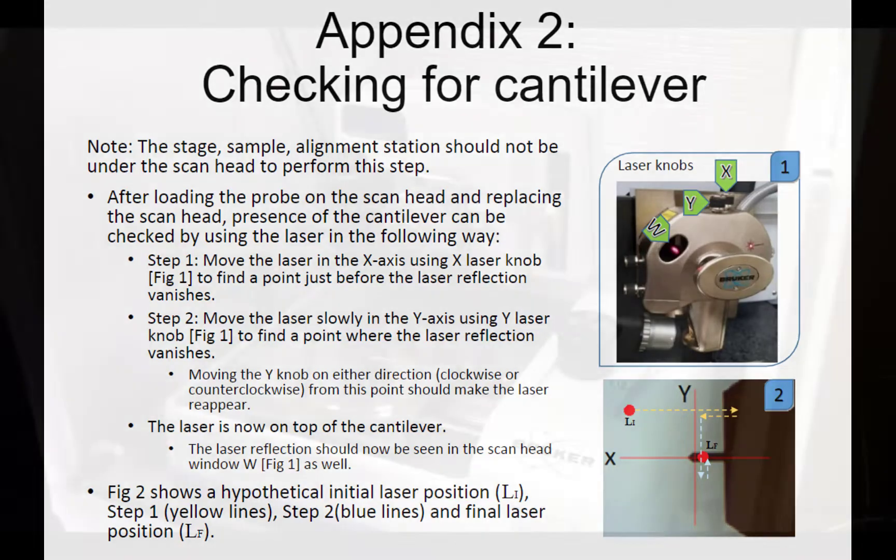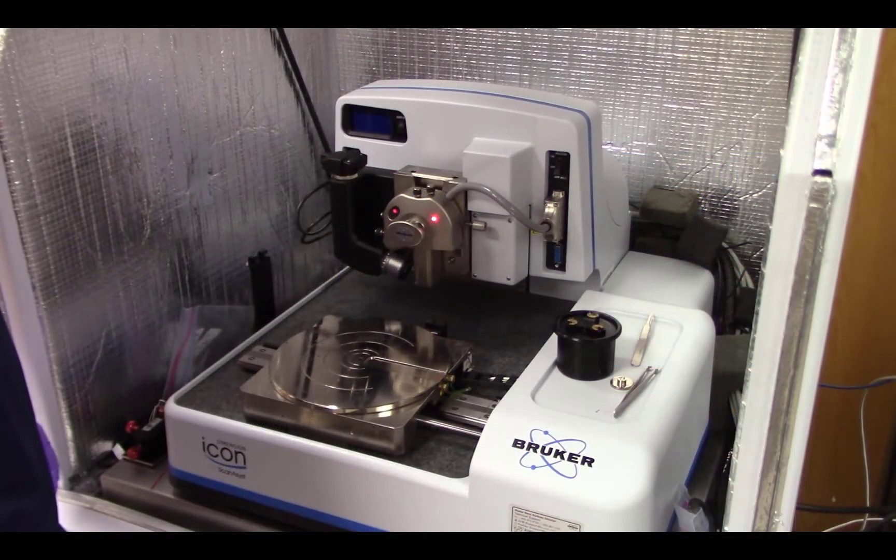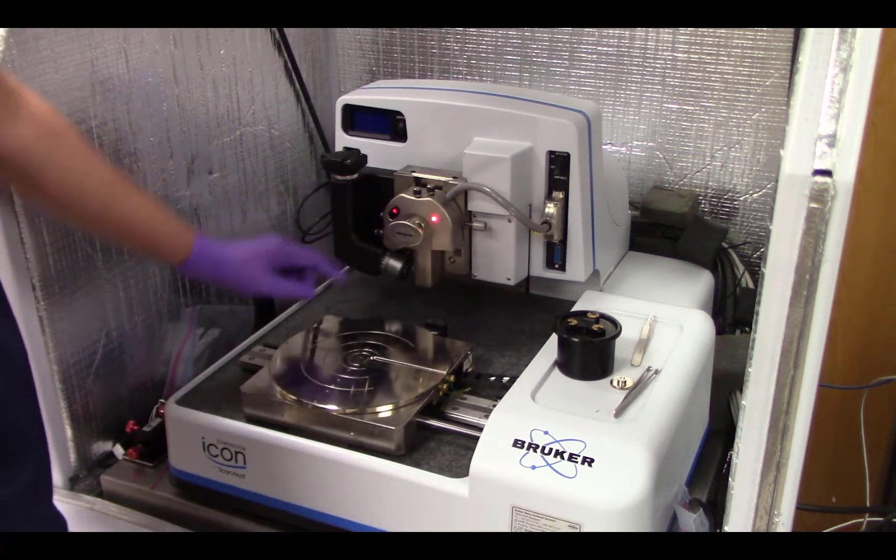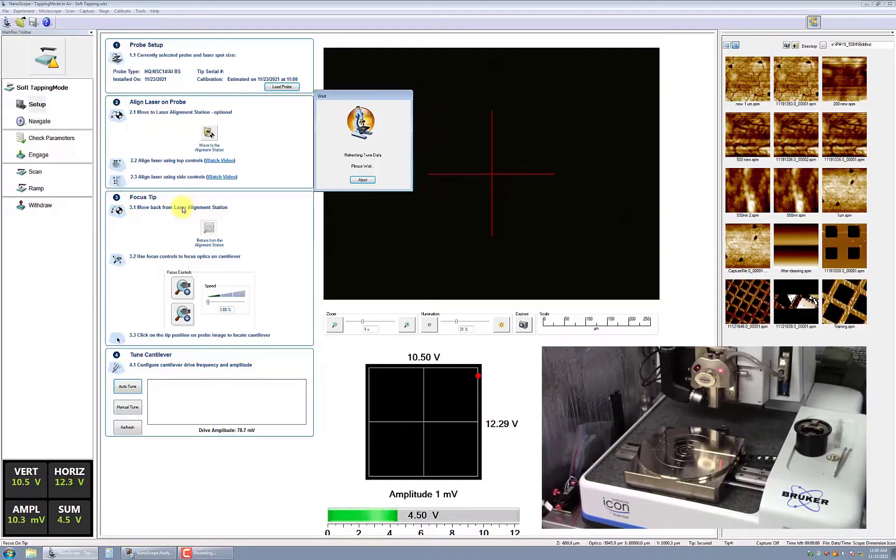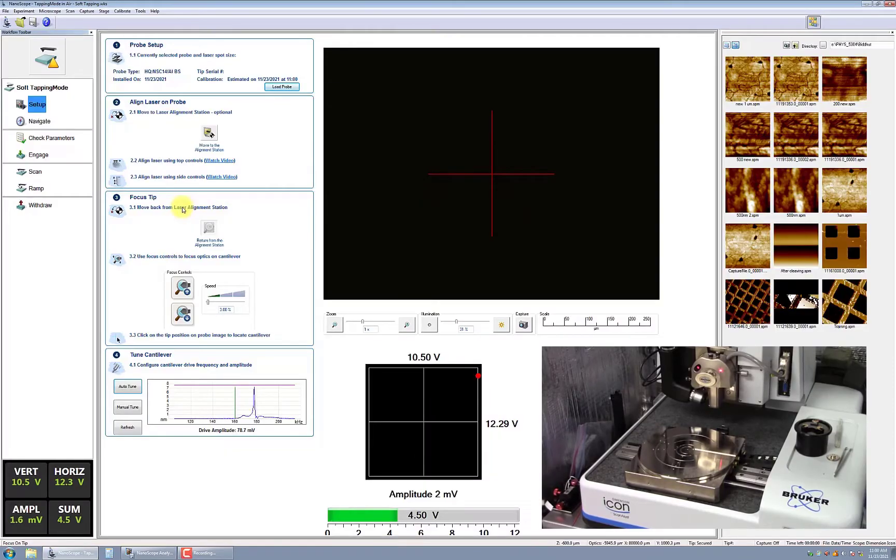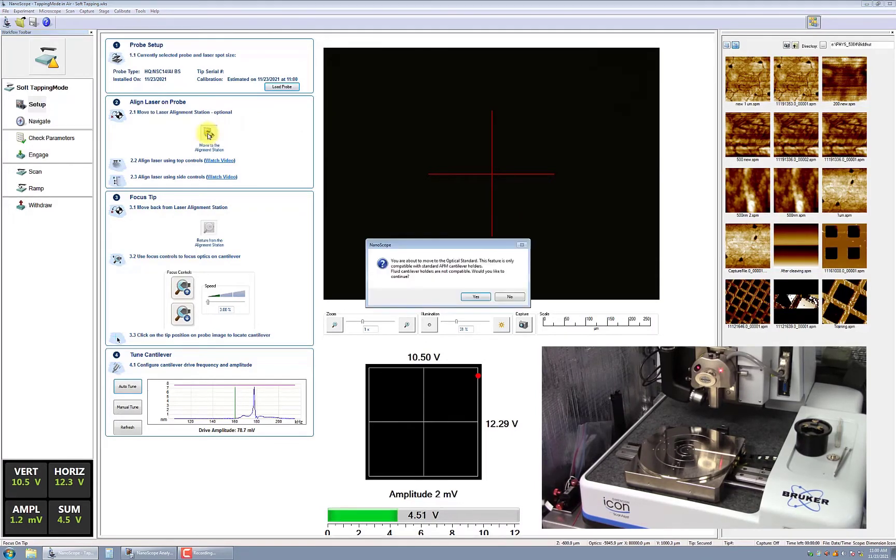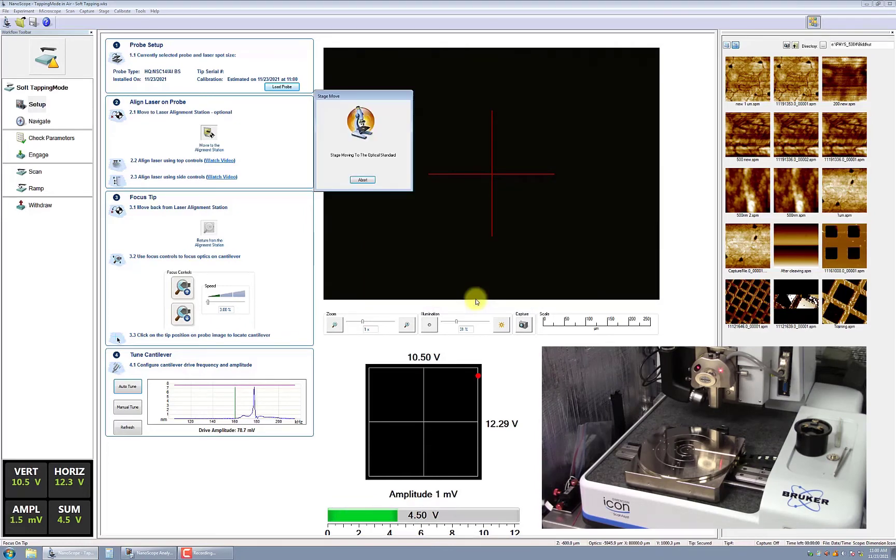As a final check, you should also be able to see the laser reflection in the scan head window. In the next box, click on Move to the Alignment Station. You will be prompted to verify that you are using a standard probe holder. Since we are performing a basic tapping experiment, you can click Yes.